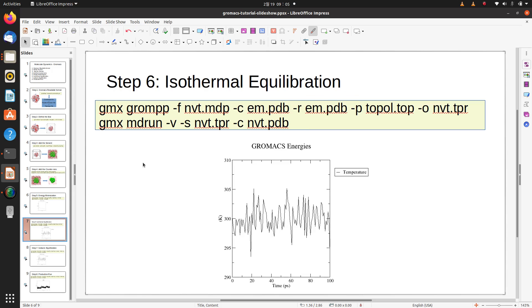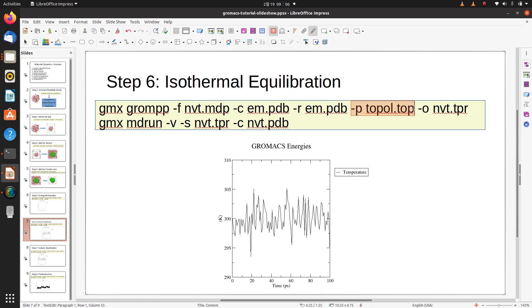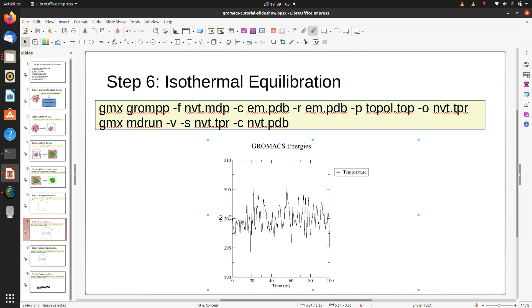The energy-minimized system is then used in isothermal (NVT) equilibration. In NVT equilibration, we specify the parameters in the nvt.mdp file, take the coordinate file generated in the previous step, also specify it as a reference file, and generate the nvt.tpr file. This is used by mdrun to generate the nvt.pdb file. In the NVT output you can see that the temperature of the system is already at normal room temperature, close to 300 Kelvin.